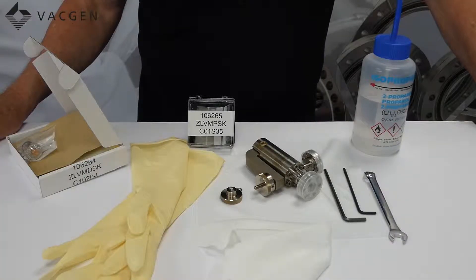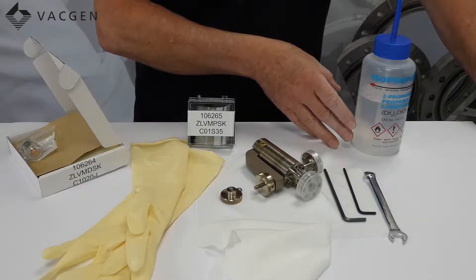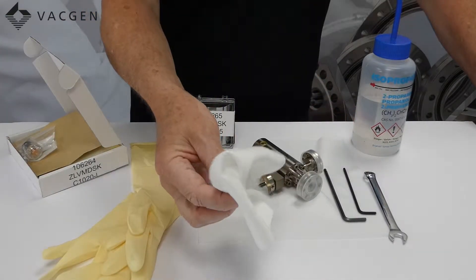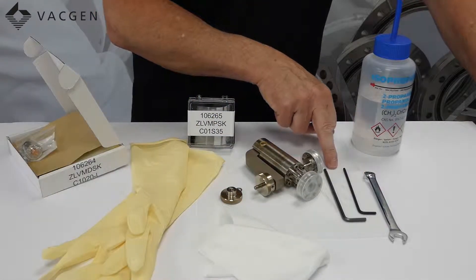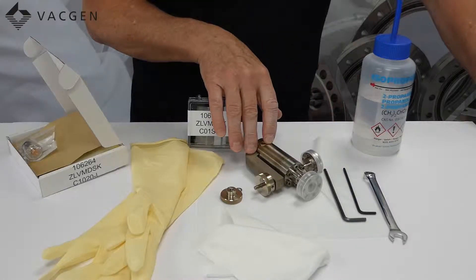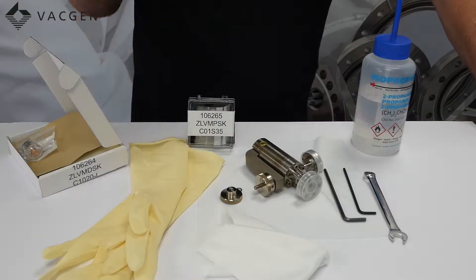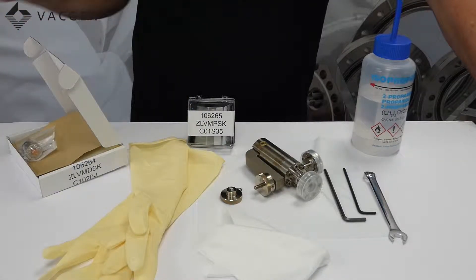On the table we have what is required to do the job. You are going to need some alcohol or isopropanol, you need some lint-free cloth, an M10 spanner, two Allen keys — a 3 and 4 — a very sad looking valve, some gloves, and there are two kits here which I will explain more about.